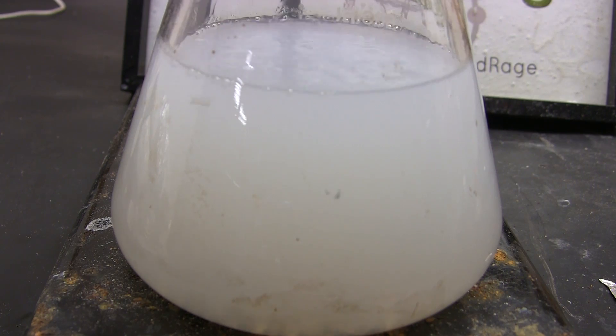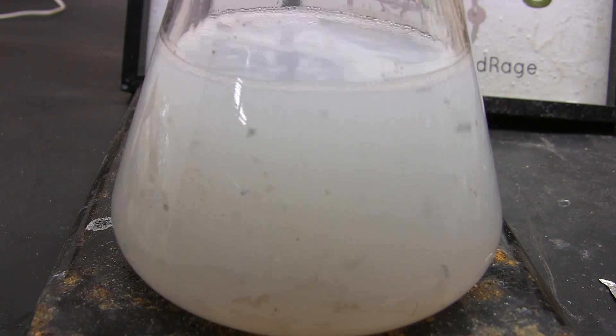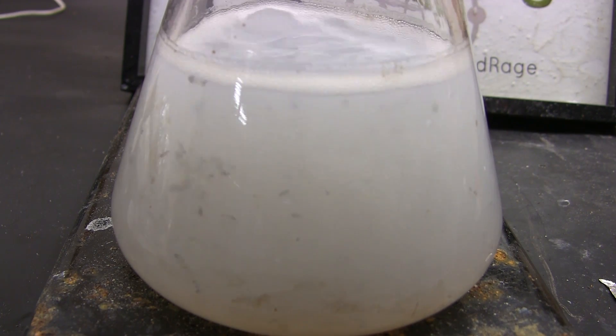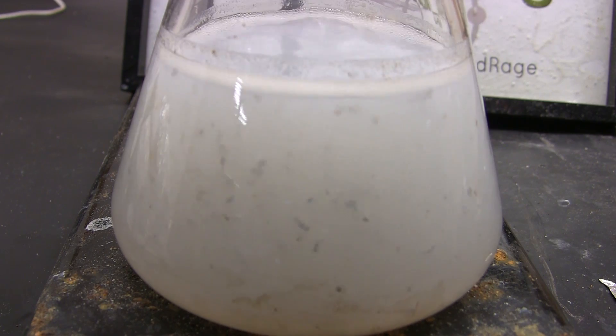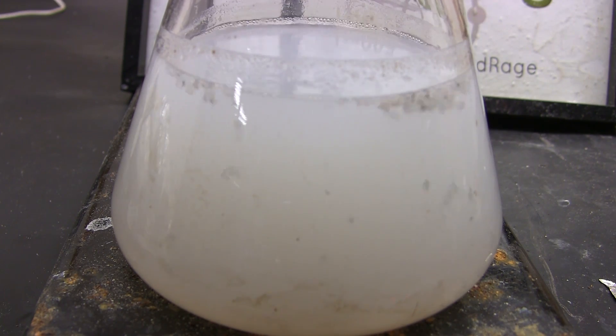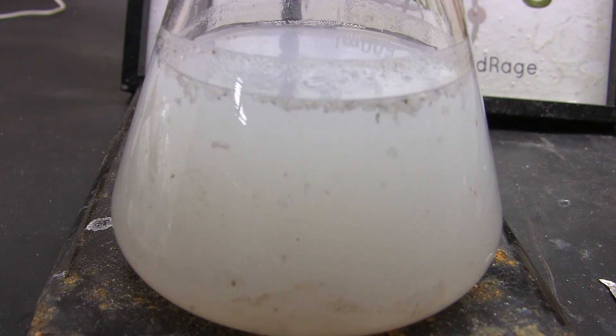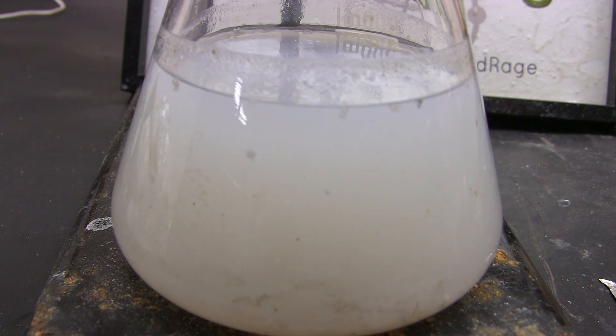Occasionally the magnesium might initially be covered in too much magnesium oxide, making the reaction difficult to start. In that case, drop in half a gram of iodine crystals or a few drops of chloroform to etch the surface and start the reaction. Magnesium drying is mostly for alcohols — do not use it for chlorinated solvents like chloroform or for acids. The reactions in those cases do not dry the solvents and can lead to dangerous thermal runaways.